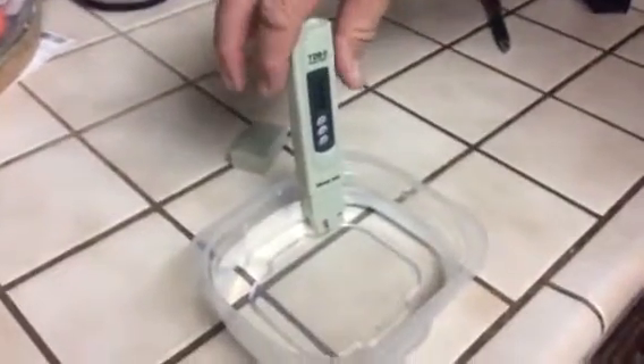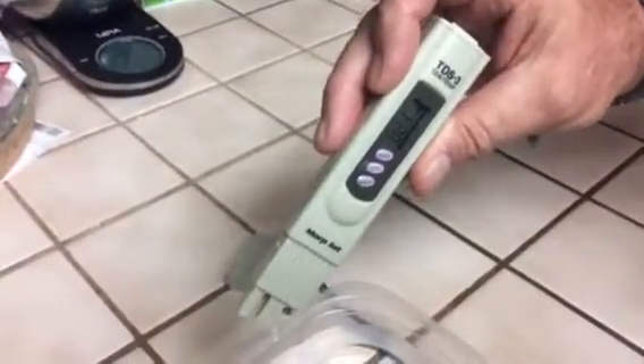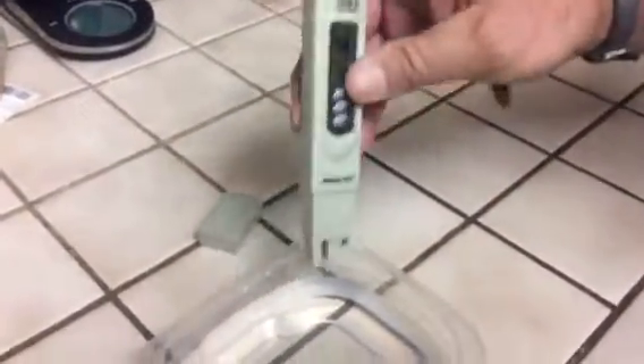This container has bottled water in it and it's indicating 21 parts per million. What does that mean? That means it's good — it's good water, it means it's purified water.